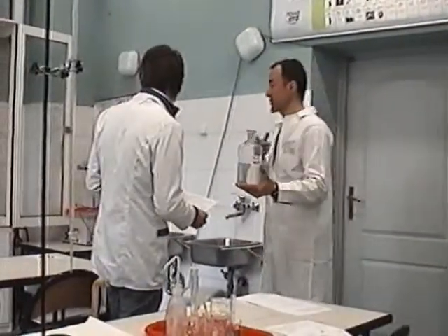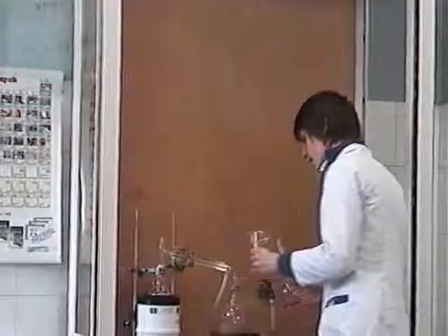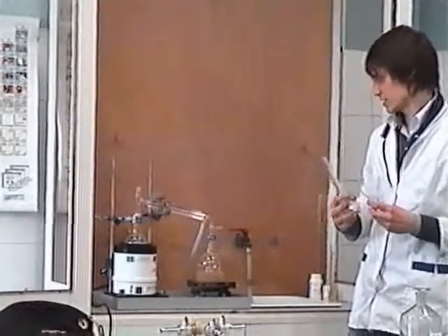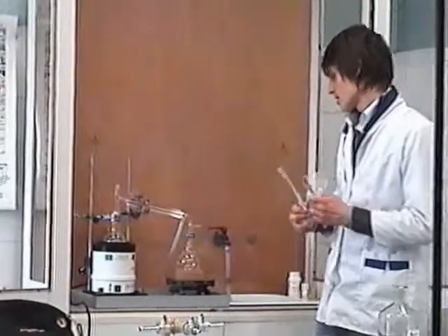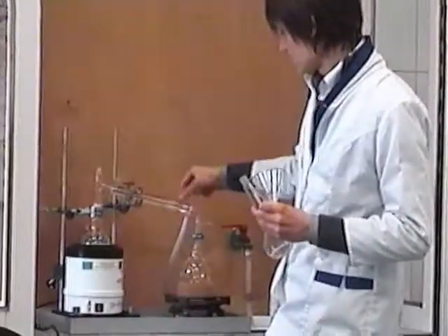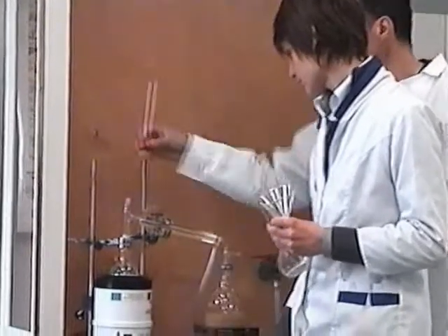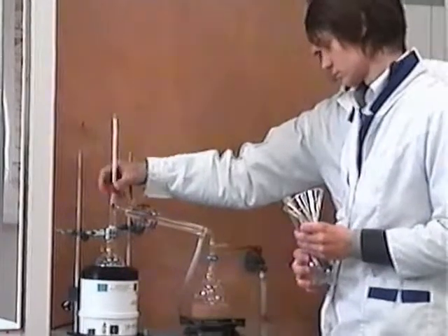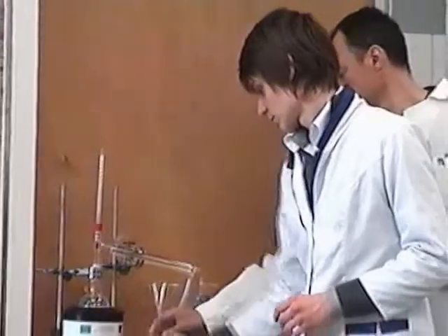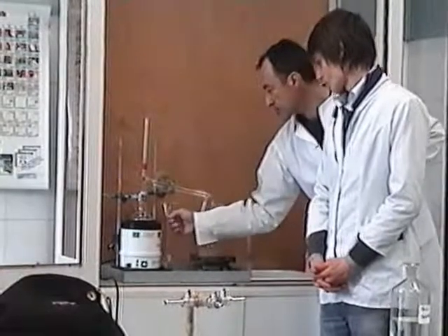If you speak louder, the comment is better. Thank you very much. So technically we will shut down this glass and switch on to the maximum speed.